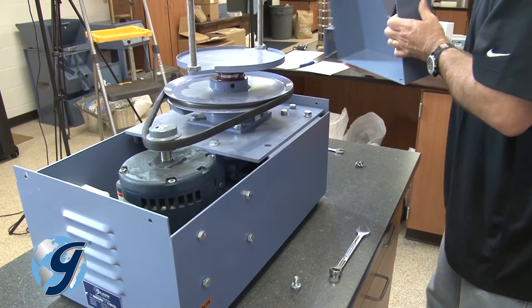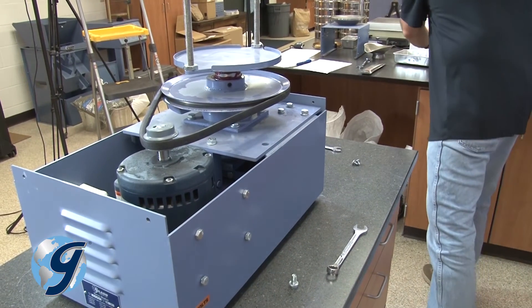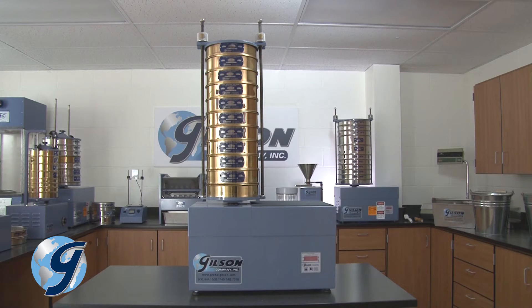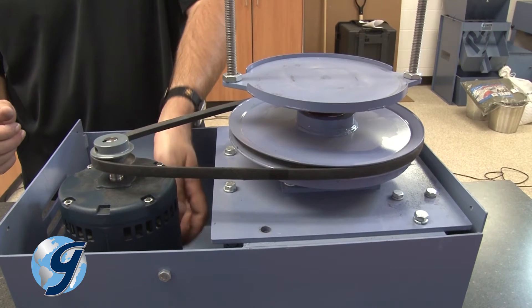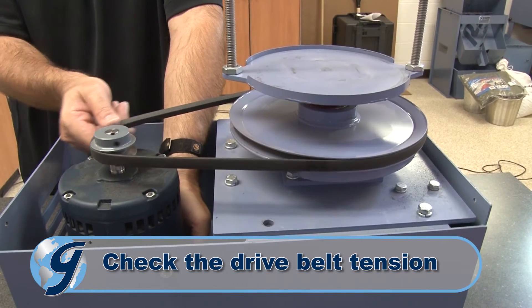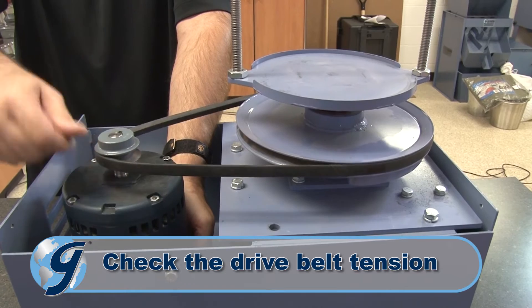You are now ready to inspect the unit. If your unit fails to operate and you have already confirmed your power source is working properly, check the drive belt tension, which should deflect 1/8 inch when properly tightened.